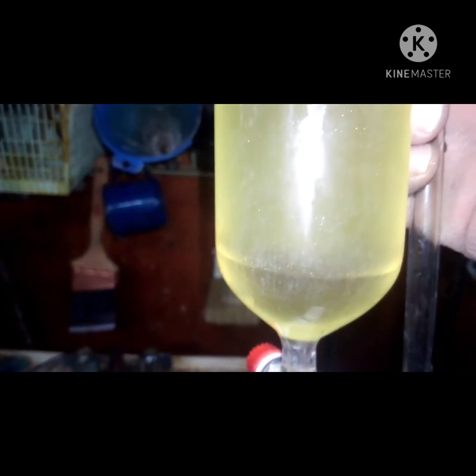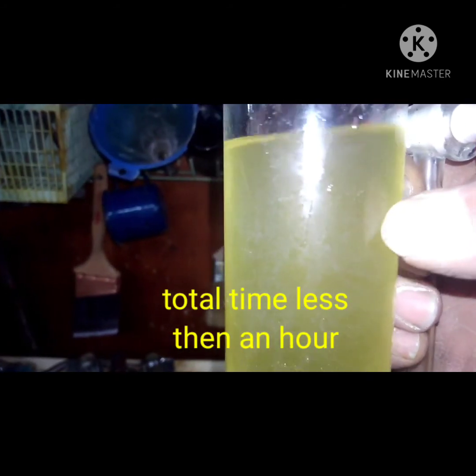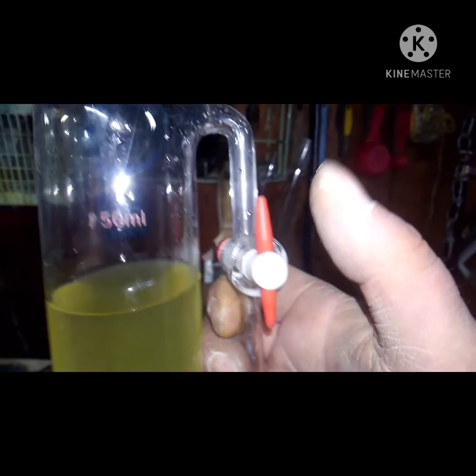Anyways guys, that's how you make chloroform. In here is also my propionic acid, and in another video I will show how to get that out and purify it too. So until next time guys, have a good one.